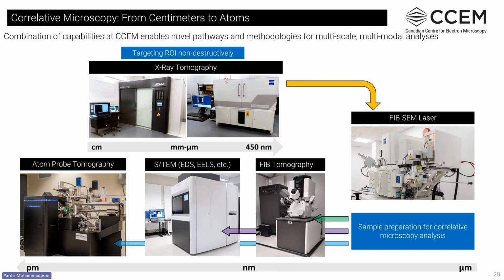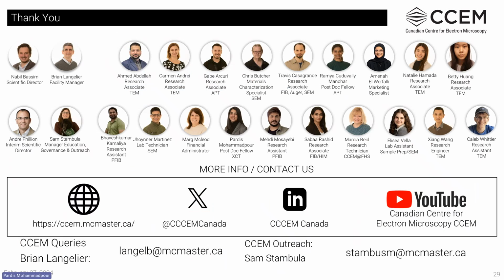This equipment allows us to study the materials over a wide length scale range from centimeter to atomic size. We can target the region of interest non-destructively using the XCT systems, then do the sample preparation using the FIB-SEM laser, and characterization of the microstructure using our other high resolution microscope.